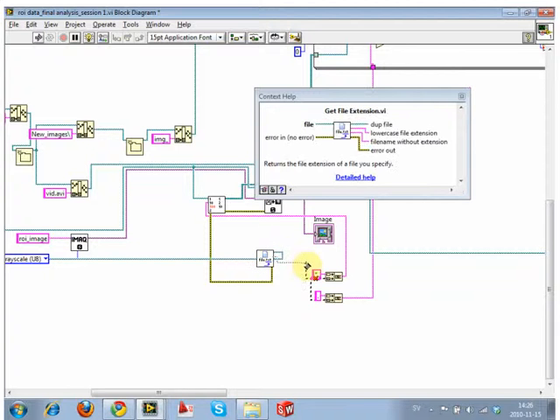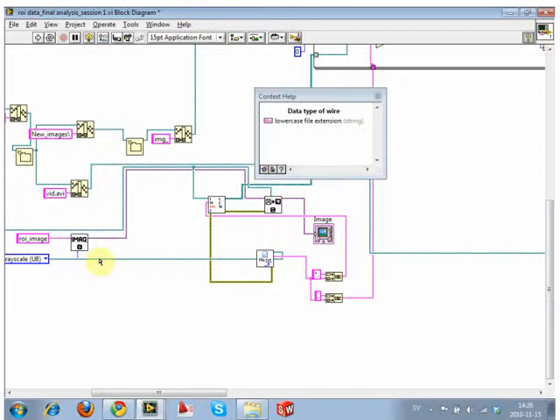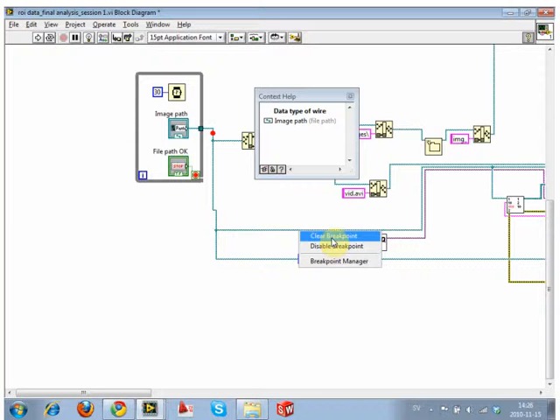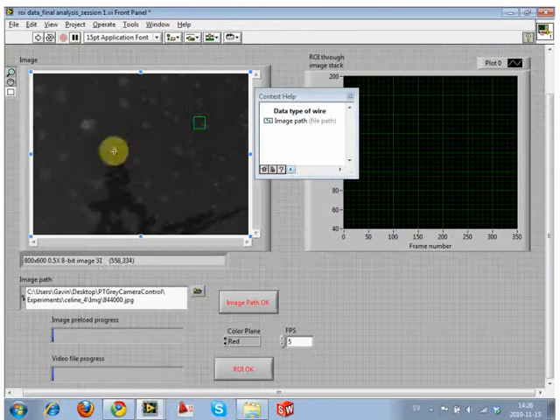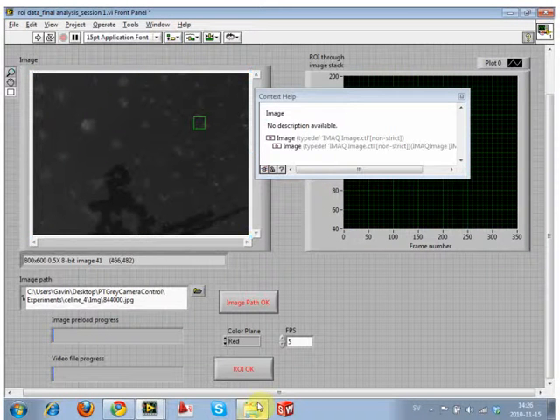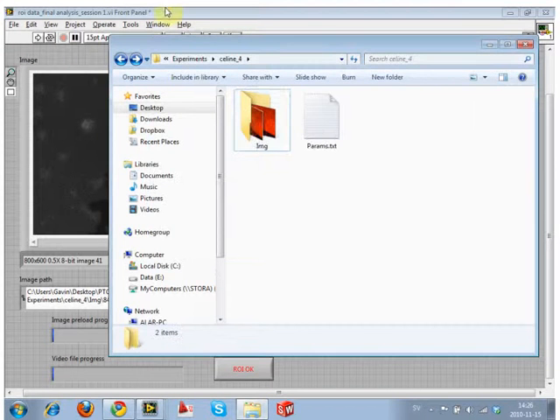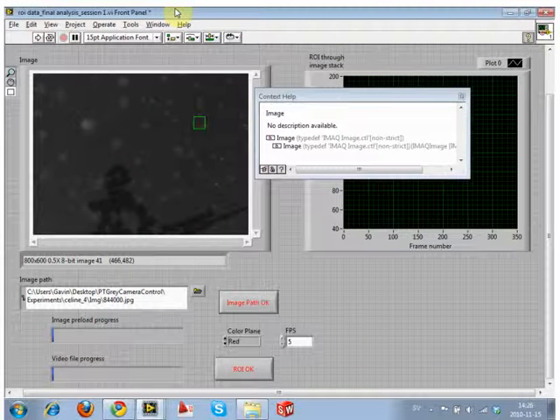So now if we remove our breakpoint, it'll take you a while before you can see things as quickly as that. You most likely will sit in front of your VI for a few hours before you figure out where the problem is. Yeah, that's what it's like.